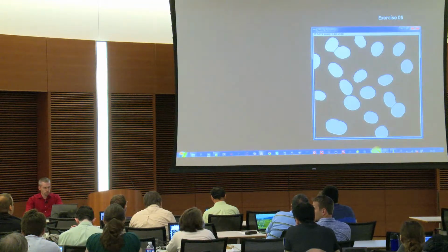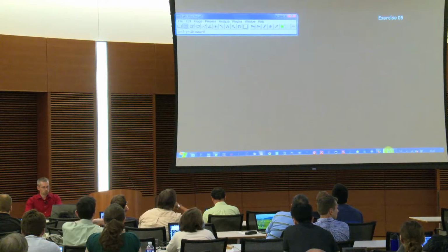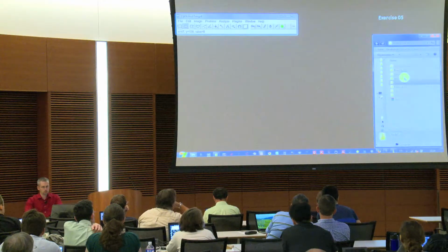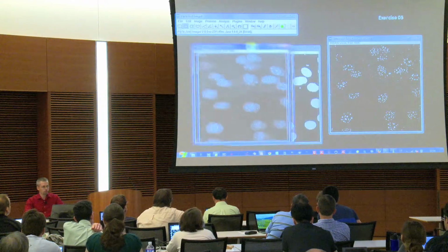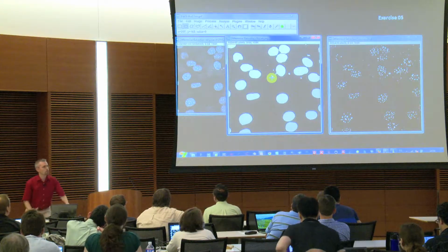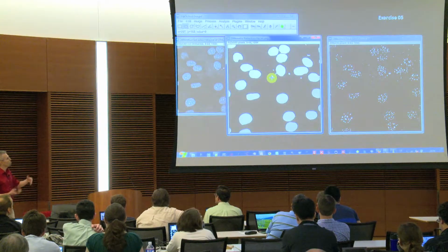So what we need is we can actually close all those images, File, Close All, and go to exercise 5. So we can open those 3 images here. This is the one you've seen beforehand already, but now extracted. So I extracted 2 things, the spots and the bubbles, because finally it might be interesting how many spots I have per my nucleus or whatever. So how many small things per big thing.